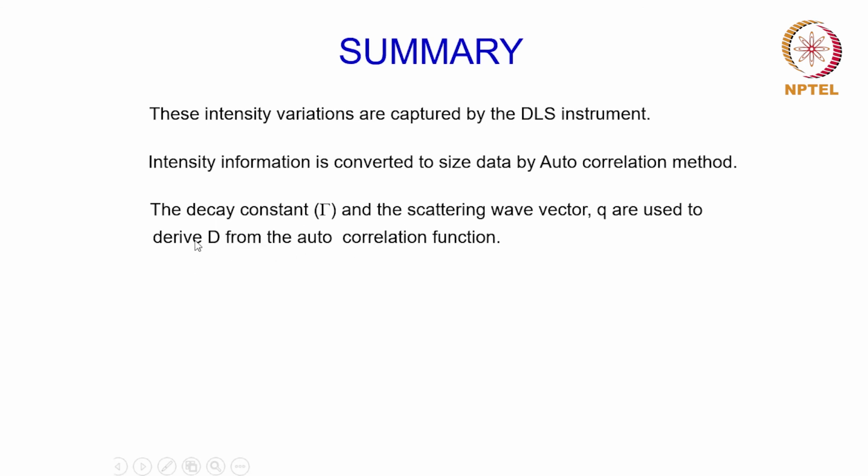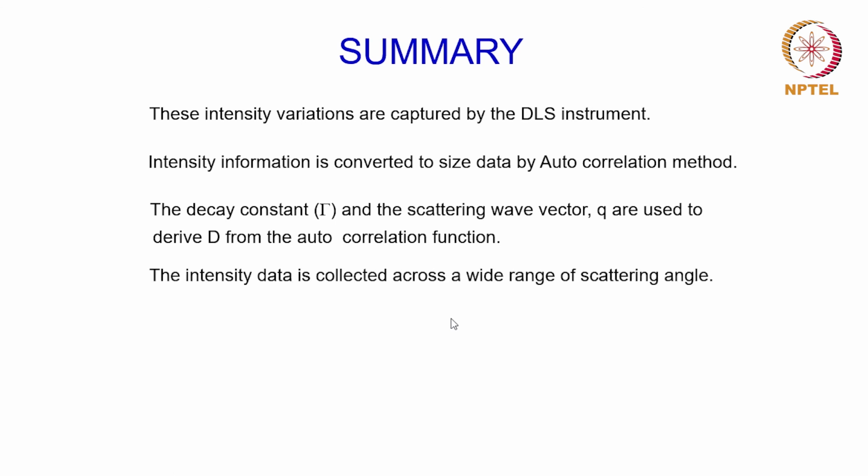Okay, so once this D is derived with the help of this autocorrelation, this is used in the Stokes-Einstein equation, and the particle size is obtained.